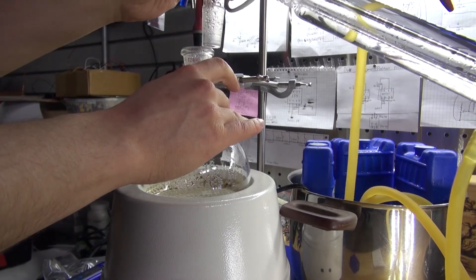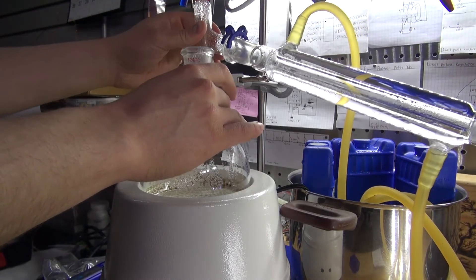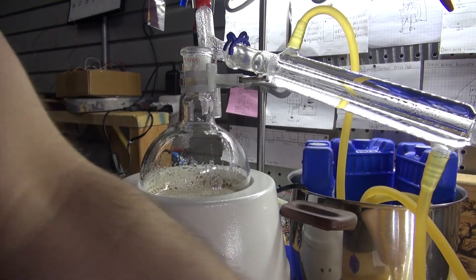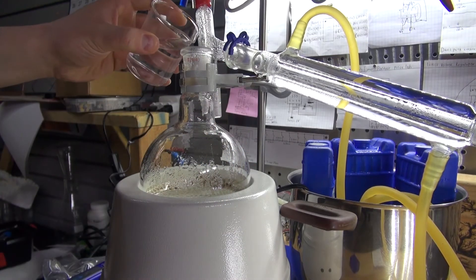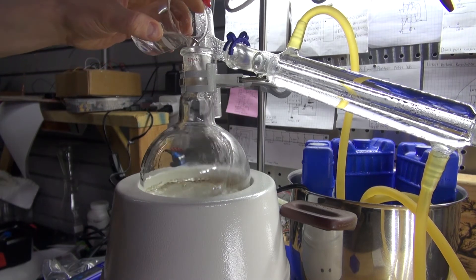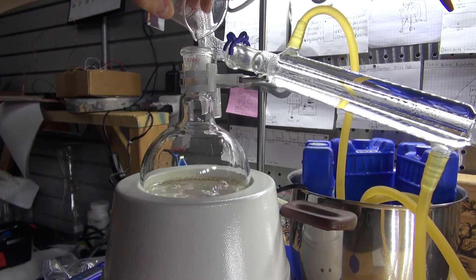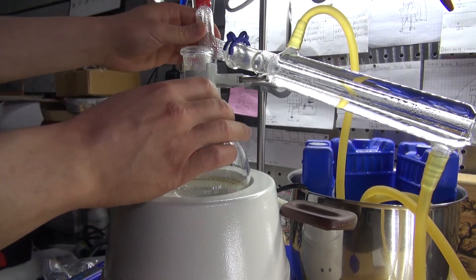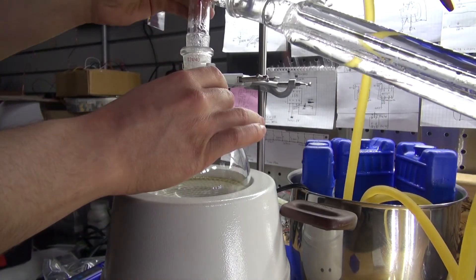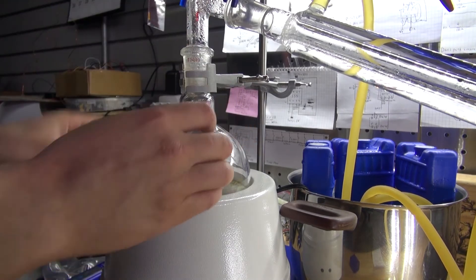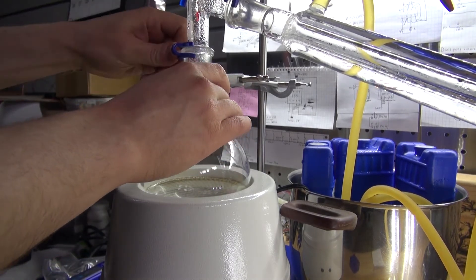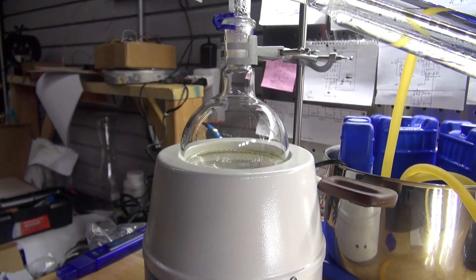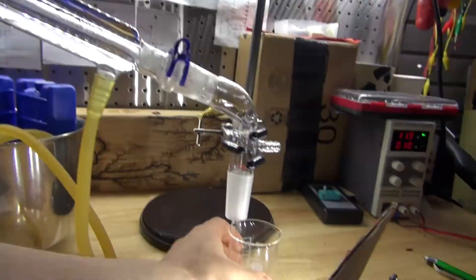So now what I'm going to do is pour the distilled water that I created back into my Florence flask and repeat the process a second time. Put everything back together. Crank up the heat and wait for it to boil and recondense.